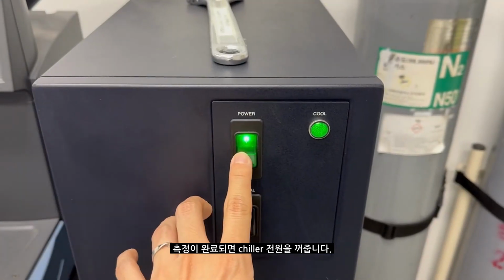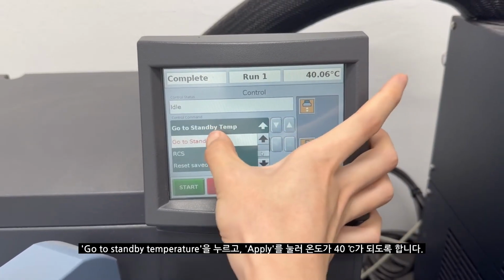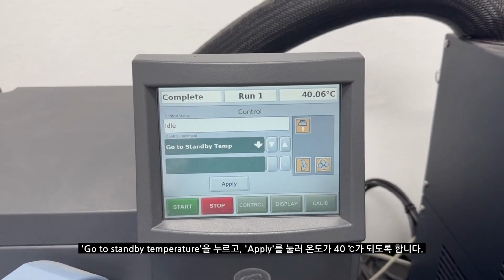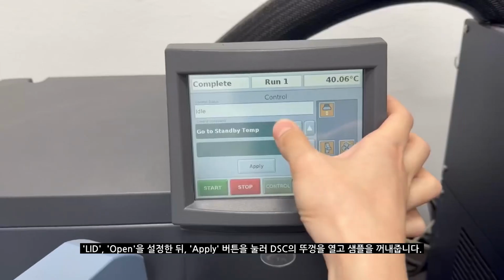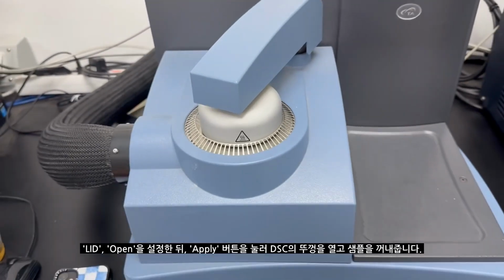After the measurement, turn off the chiller. Press go to standby temperature, and press apply button to descend the temperature down to 40 degrees Celsius. Set lid, open, press apply button to open up the DSC's lid and remove the sample.